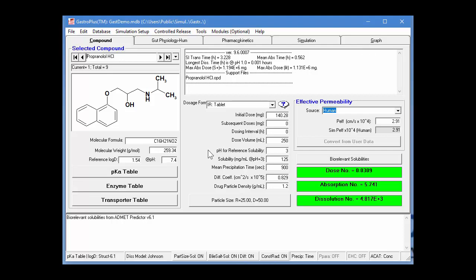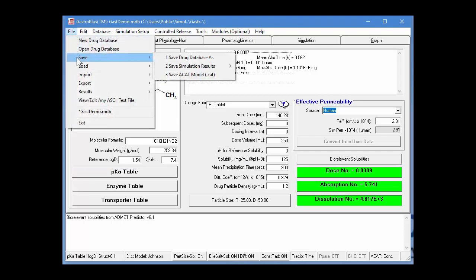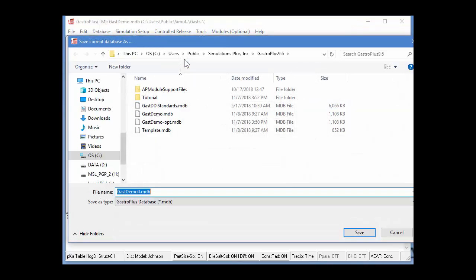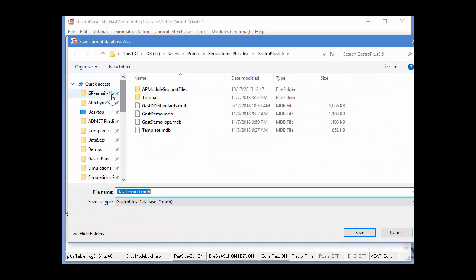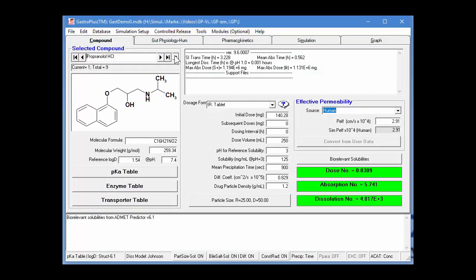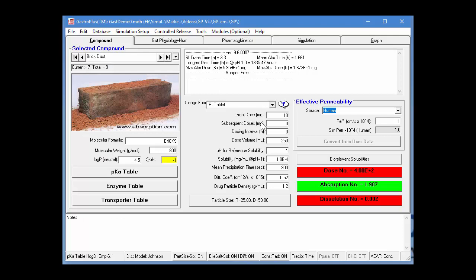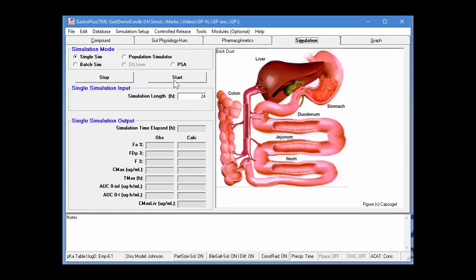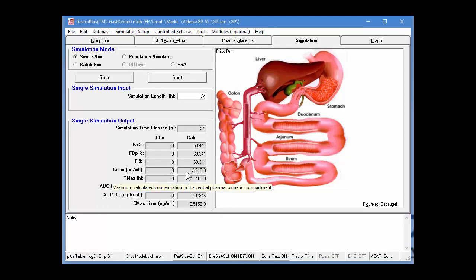For the first tutorial, we use a record in the GasDemo database. Since you can't write to this database, the first thing I'll do is save it under a different name in a local directory. I go to File > Save Drug Database As, navigate to my local GP folder, and save it as gasdemo0.mdb. Now let's go to the Bricudas record. We see the dose is 10 milligrams, and we'll go into the simulation tab and perform a simulation. With the 10 milligram dose, the fraction absorbed is 68% and the Cmax is 3.3 × 10⁻³ micrograms per milliliter.